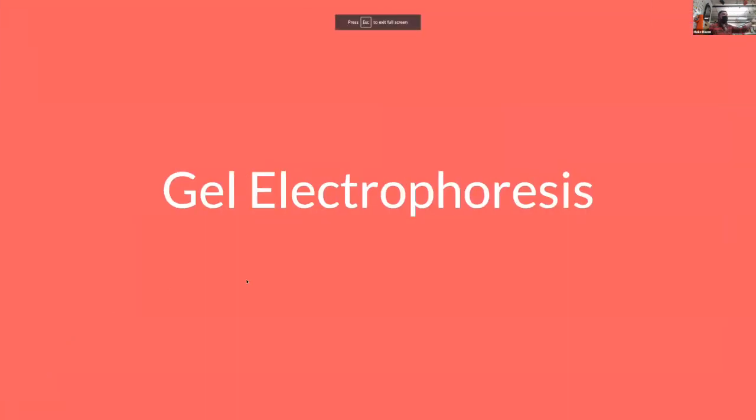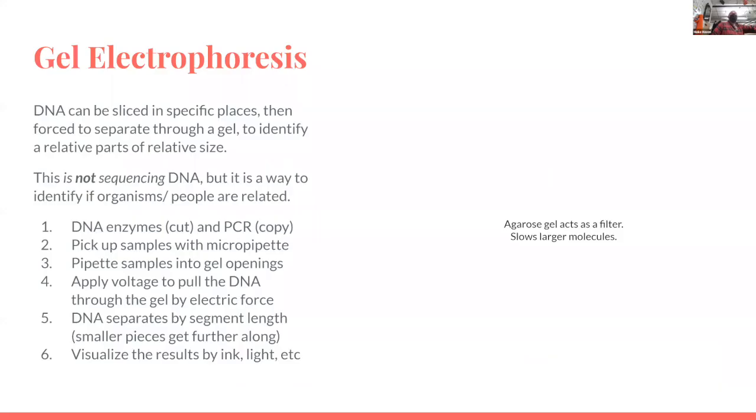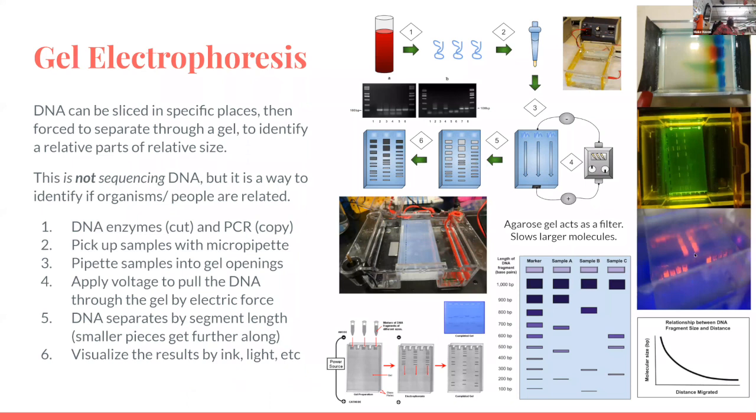And so once we do all of that, you're going to have a big copy of your DNA from PCR, and then we're going to do gel electrophoresis. Gel electrophoresis is this stuff. If there's a science thing that CSI Miami does to show off what science is, it's the gel electrophoresis that's glowing under a black light. And so it's a real fun looking thing. You can see how your DNA works. Basically, it's a gel filter, and we'll be able to see what kind of gene you have by how much your gel runs. So this is an interesting piece of this puzzle.